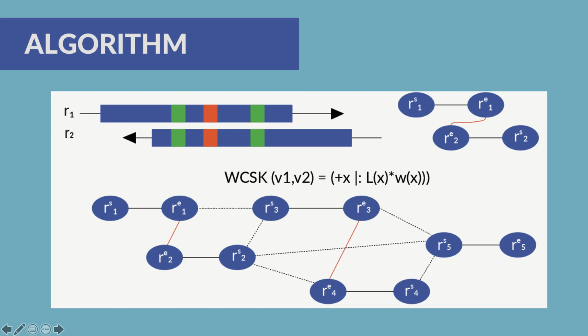A complex undirected graph is then constructed, having two vertices for each read representing the start or the 5' end and the end of the read that is the 3' end. Vertices are saved to collect information useful to identify chimeras and calculate distribution of different features. Overlapping reads are identified by matching k-mers between them following an efficient algorithm similar to that implemented in WTDBG2.